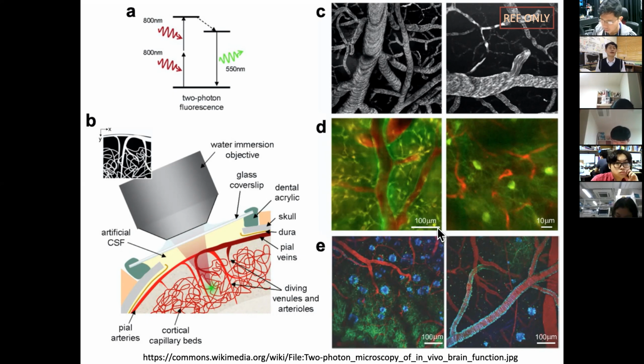And even for those who are studying Alzheimer's disease, there's even dye which makes this amyloid plaque show a specific color so that you can actually see and quantify and analyze the amount of amyloid beta.